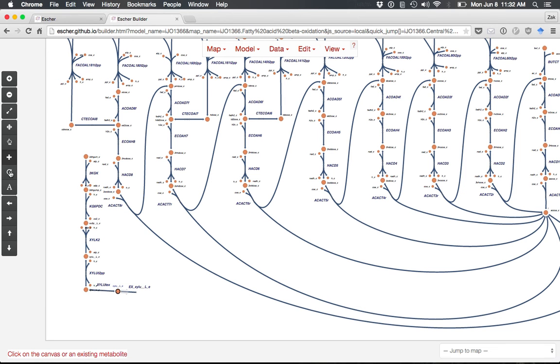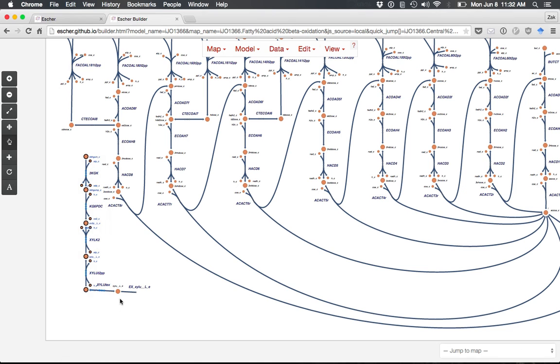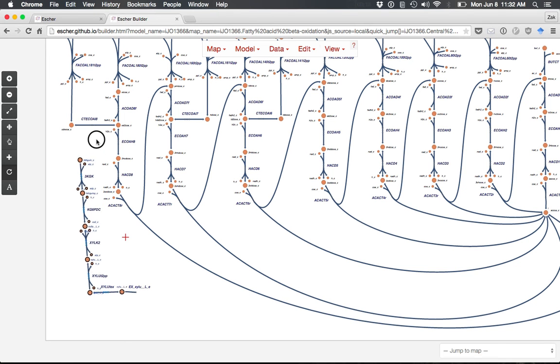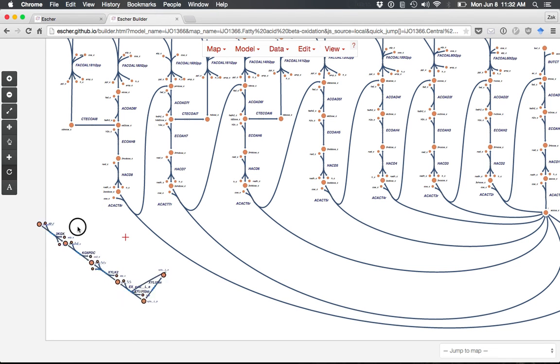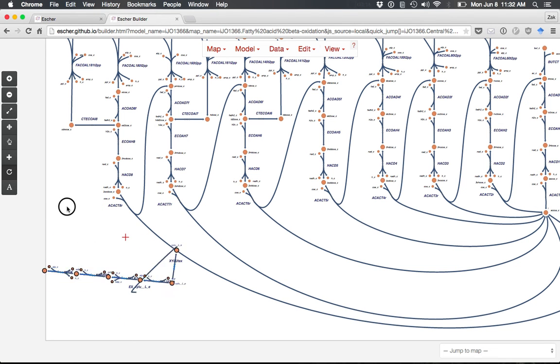There's also a Rotate Mode. If you've selected a set of metabolites, you can enter Rotate Mode, drag the center point to position your rotation, and then drag anywhere to rotate the pathway.